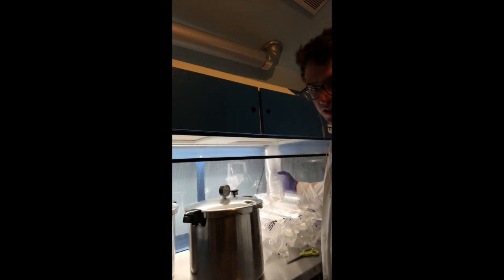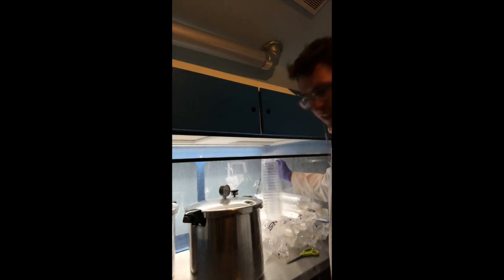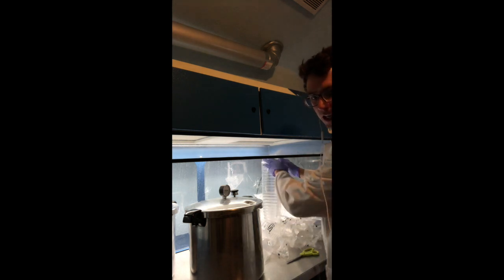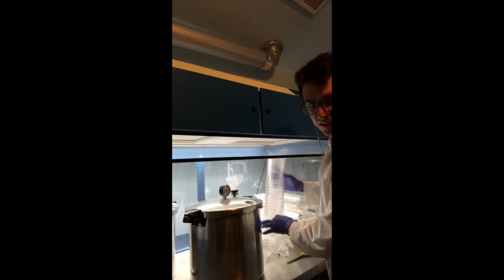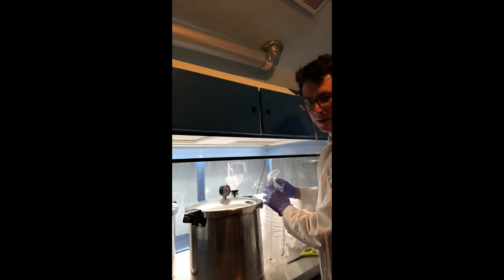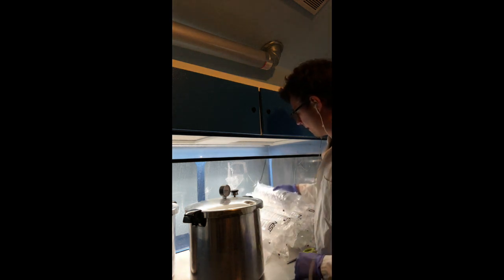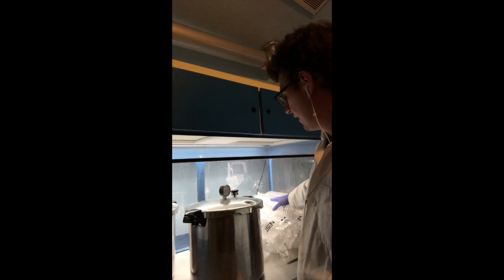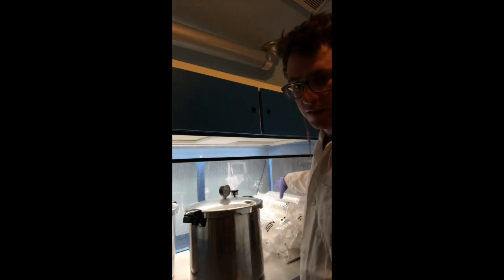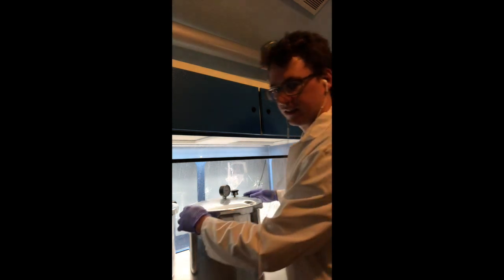Essentially, all these plates, I'm going to stack them vertically and then cut off the bottom of these plates like this and pull the sleeves off by pulling up the plastic and stacking them up. So I'm going to be doing that and setting them off to the side. You can just watch me as I open these.